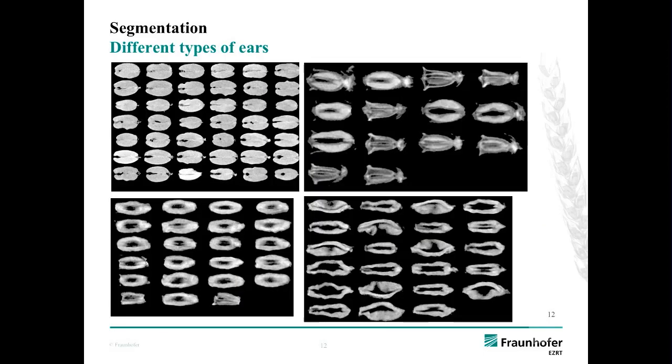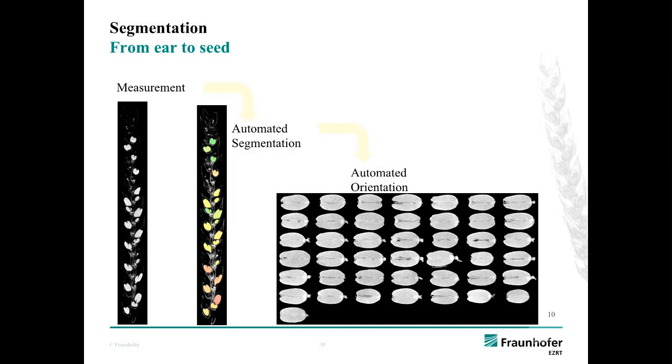So you see here the different colors, which also indicates that each seed is detected by the algorithm.